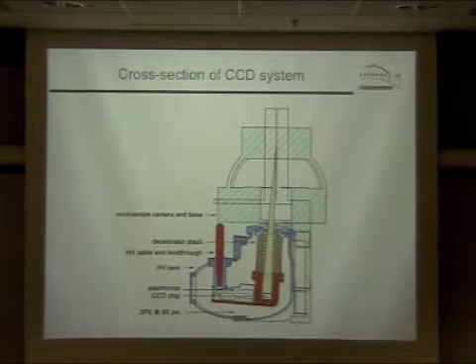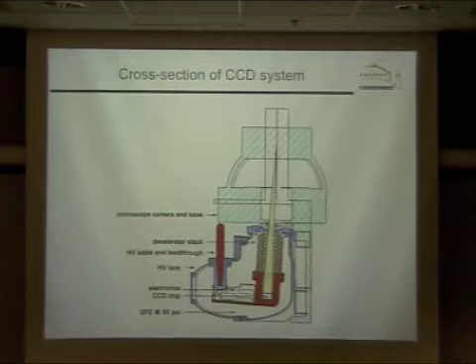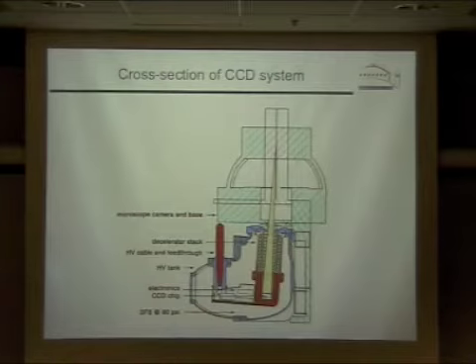There's a retarding electric field that the electrons see as they come out of the bottom of the microscope before they hit the CCD camera. So we have a commercial accelerator tube, just reversed to use as a decelerator. That's this section in here. The electron beam comes down through here.